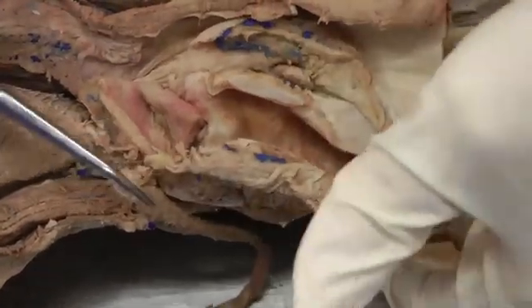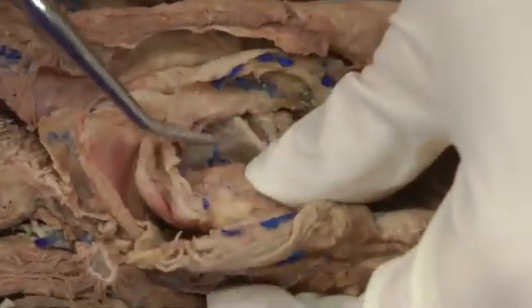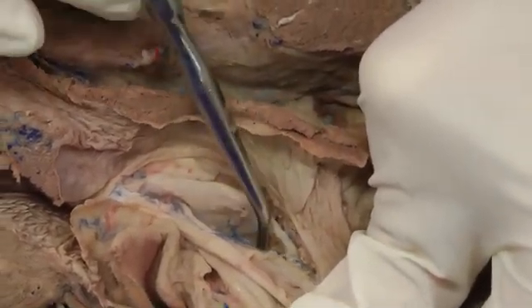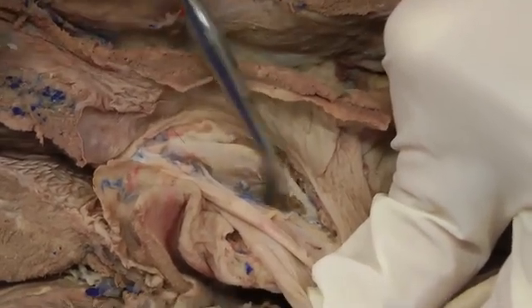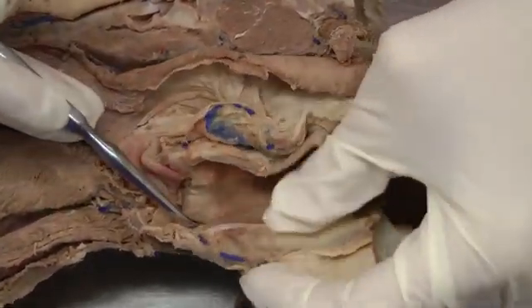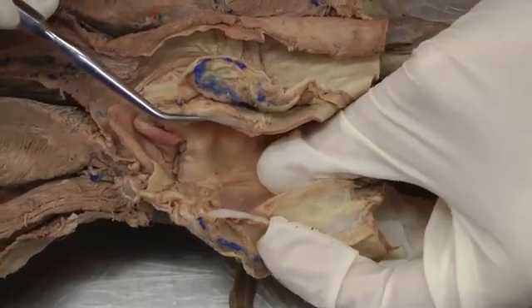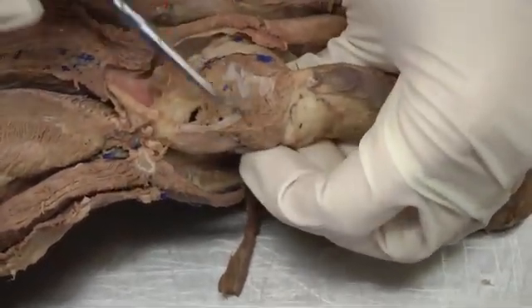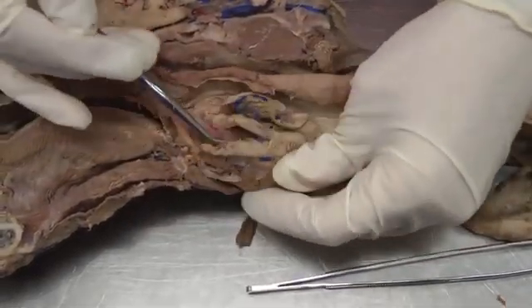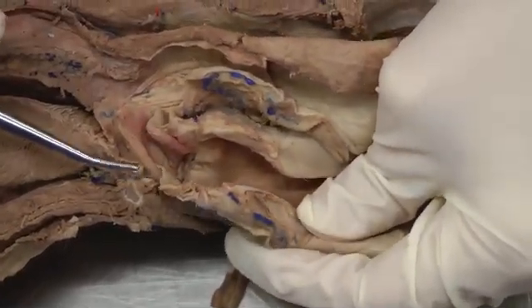Then we have the thyroid cartilage, which makes a U-shape — you'll see it on the bottom, and you'll also have to pull it out and cut the mucosa of the wall. Here you can see thyroid cartilage in the wall; you can palpate it and cut open the mucosa to see the rest. It's a U-shape that cups around the larynx. Then we have the cricoid, which is like a ring — it has a broad top and a small piece on the bottom, like the band of a ring you wear on your finger.